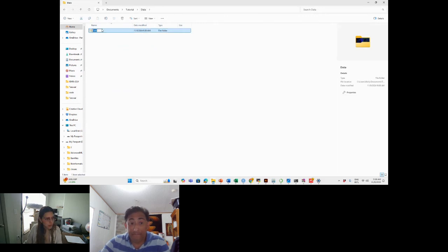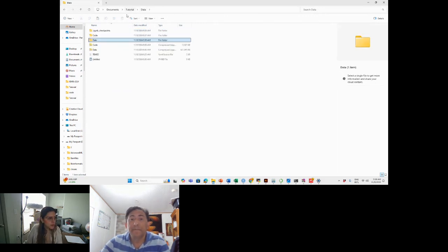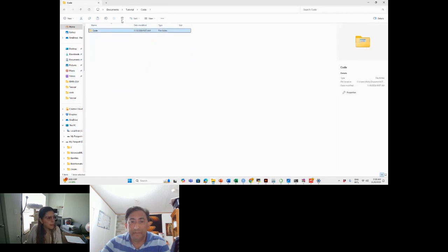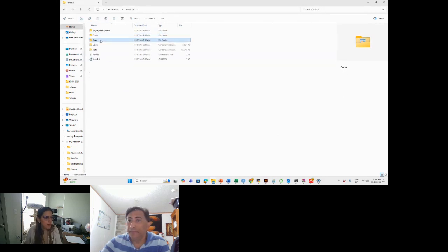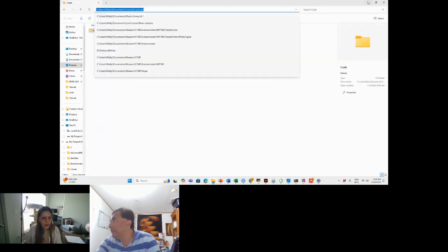I'm going to move it because we have two. Let's just move it in here. Let's see if we can. Yeah, better. And also this one. Okay, good. So now we have the code and we have our data, and then we're ready to start.